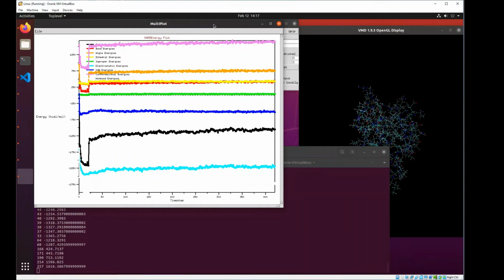And that jump from here may not be completely the ground state of the protein at 0 degrees Kelvin, but it is at room temperature, which is the realistic portrayal of what this protein is going to do at room temperature, by the way. So room temperature and physiological temperatures are different. If you want to go to physiological temperature, then instead of 25 degrees Celsius, you need to go slightly higher, to approximately 38 degrees Celsius. And that would be the more realistic depiction of what this protein is doing. So this jump that you see here is because of suddenly exposing it to background radiation at room temperature.